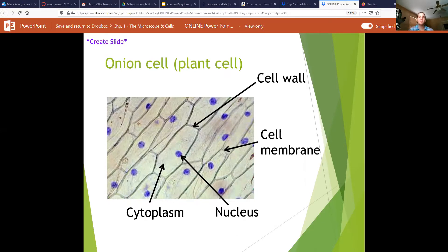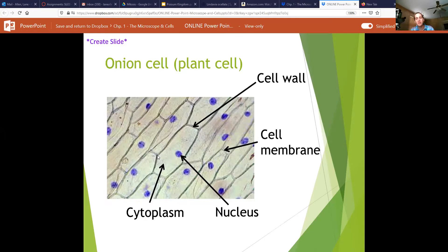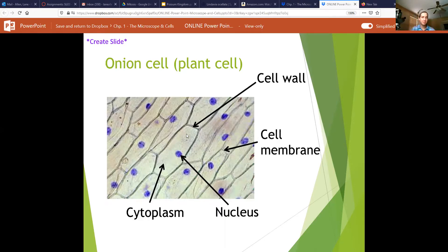Cell walls will appear as these thick dark lines separating the cells. The cytoplasm will be the empty space on the inside of the cell. It's not empty, of course, just like the air in the room that you're in isn't empty space.